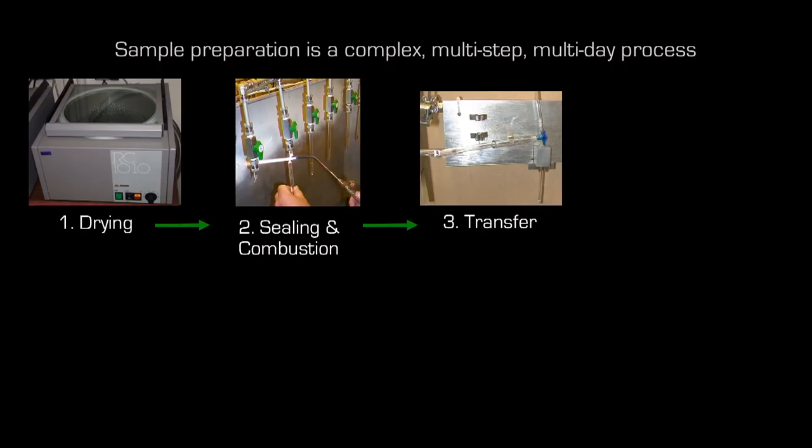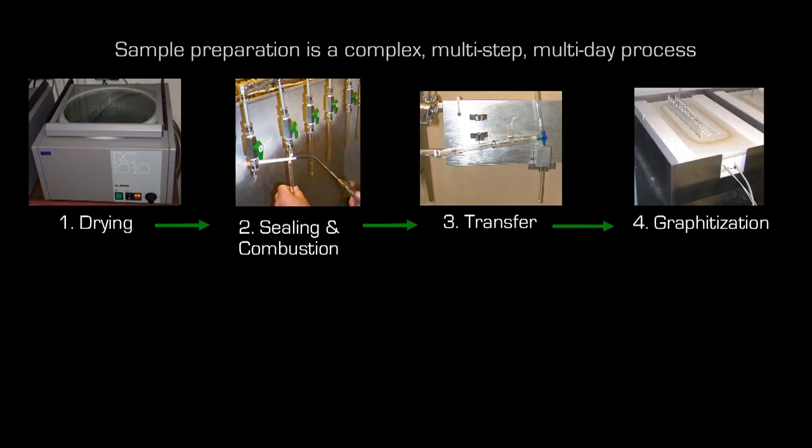And we do that by using liquid nitrogen, and that is called cryotransfer. It transfers the CO2 to the special reaction tube, where we form the graphitization process through chemical catalysts. A catalyst is just a chemical that drives your reaction to where you want it to go. So we want it to go to graphite. So again, it's another heating step at about 700 degrees Celsius, and with these chemical catalysts, the CO2 gets converted to graphite, which is a pure form of carbon.